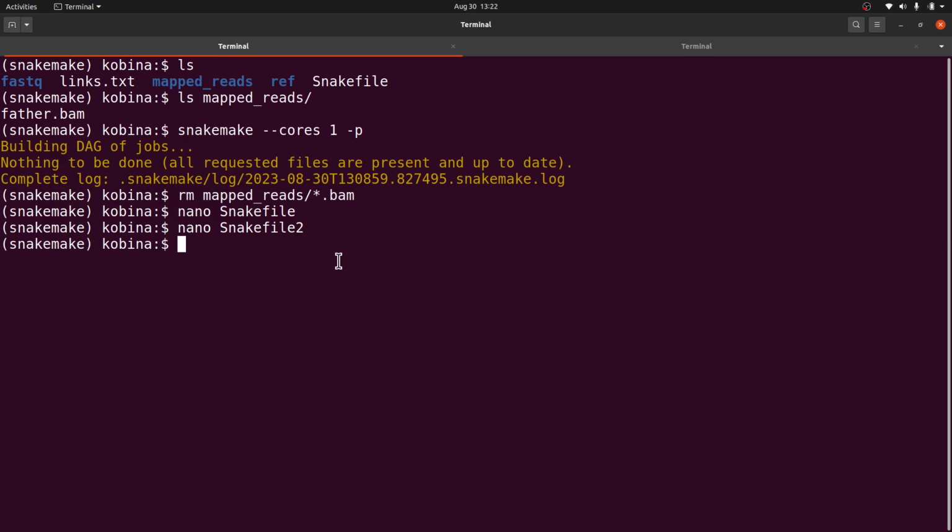You can reuse any of them, but for now it's just snakefile2 because snakefile2 is generic. Whenever we make any major change, we are going to give it a different number. It's a way to also keep track of your scripts and pipelines, so that if there's the need to reverse to an old one, you can quickly reverse to the previous version. Okay, so let's do this.